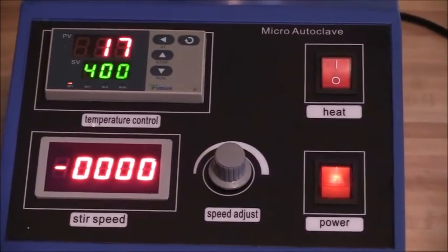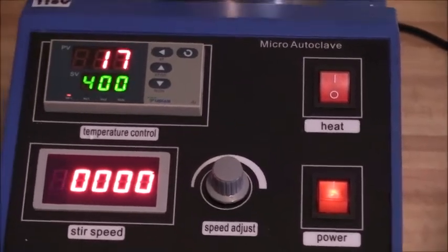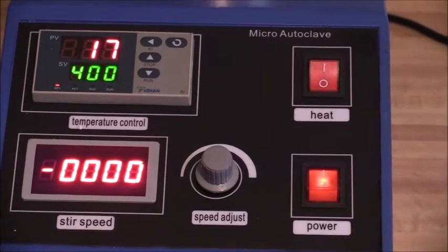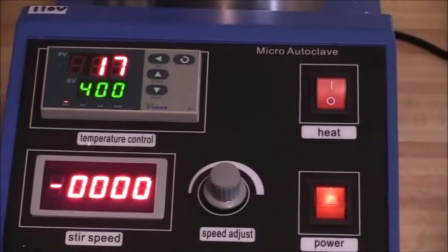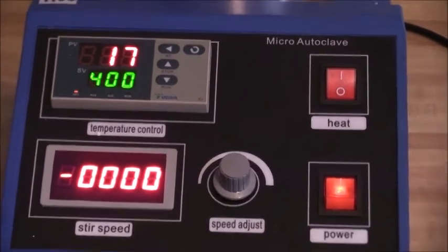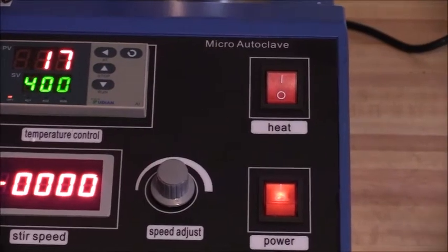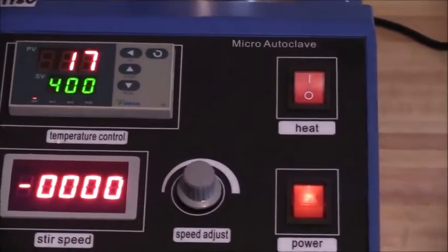Let me explain all of the numbers that you are looking at. The top number on the left, in red, is the present temperature of the vessel in degrees Celsius. Below that, in green, is the temperature which the vessel is set to heat to. You can set the temperature all the way up to 400 degrees Celsius, which is displayed here.